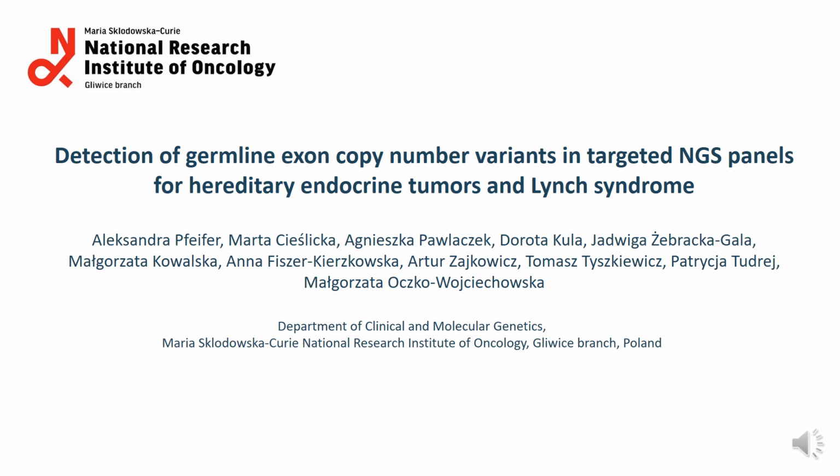Today I would like to talk about detection of germline exon copy number variants in targeted NGS panels for hereditary endocrine tumors and Lynch syndrome.